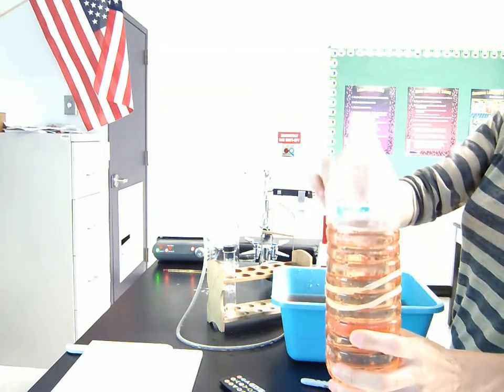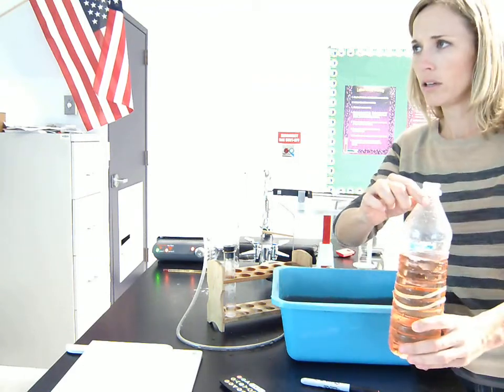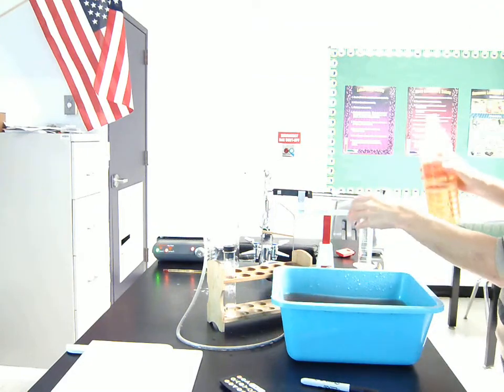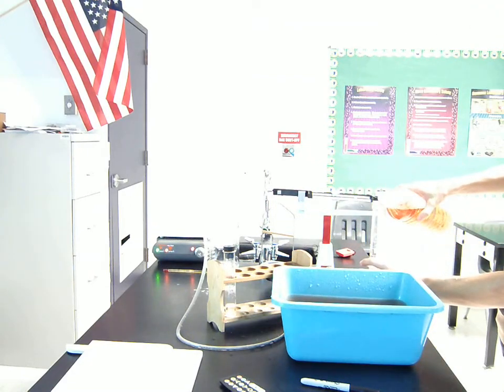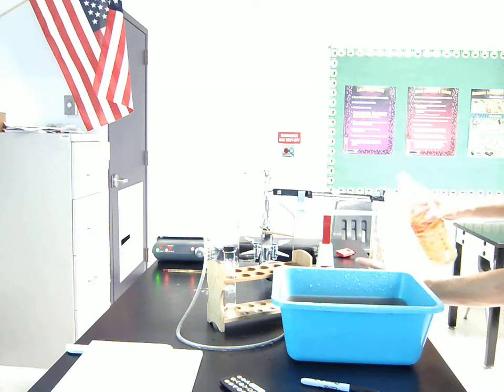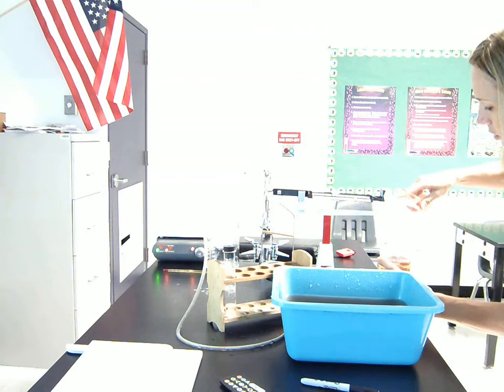So you can see it. That's how much, you can stand and see it probably better. From about here to here, that's how much gas was produced. So we're going to figure out how much water is left over. I'm going to use a 100 milliliter graduated cylinder to be more precise, and measure 100 at a time, so I can figure out how much. That went a little over, so we'll pour some of that back.